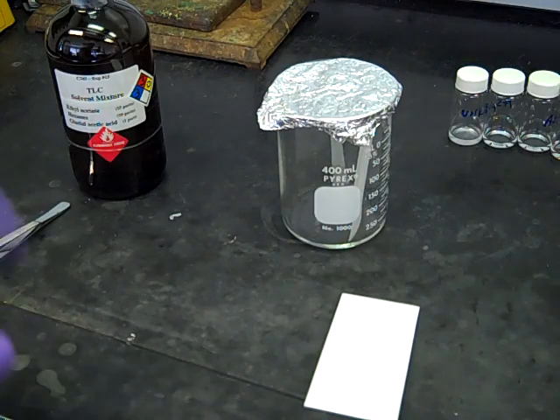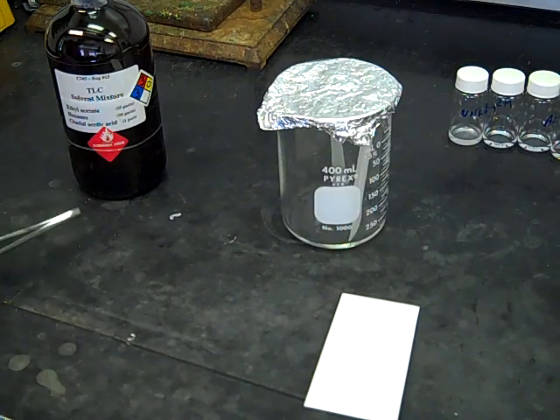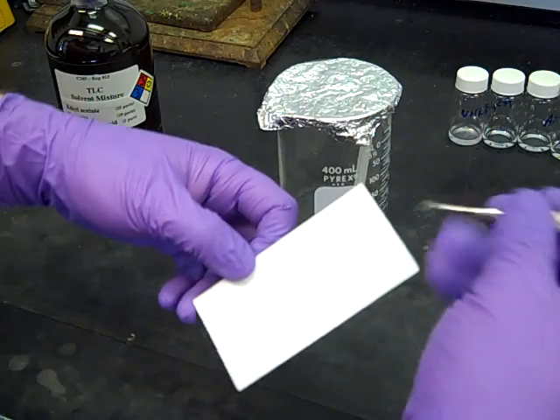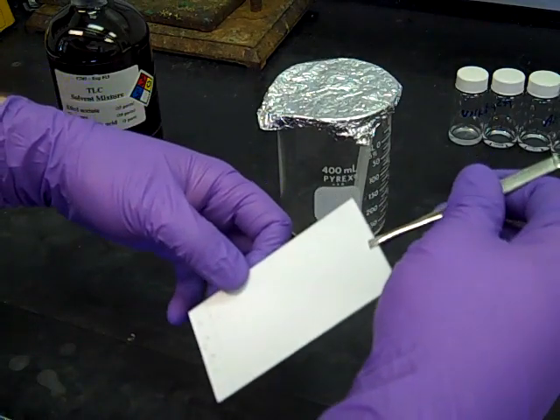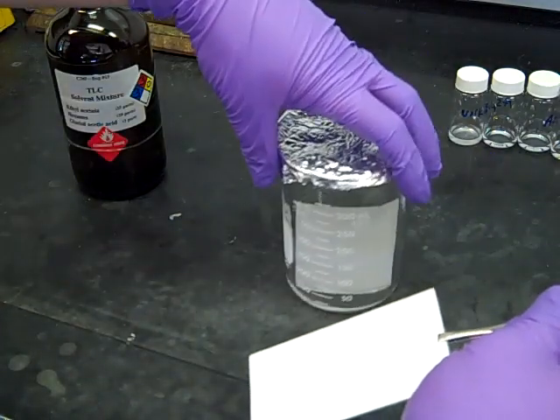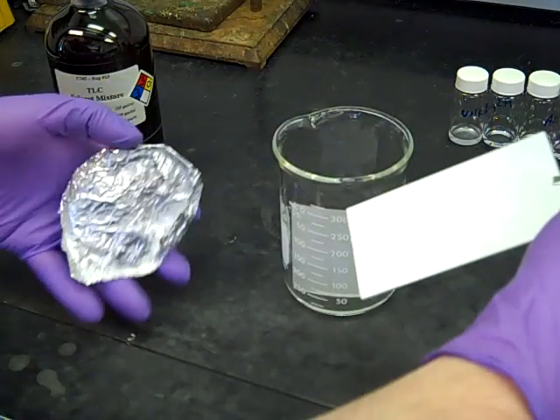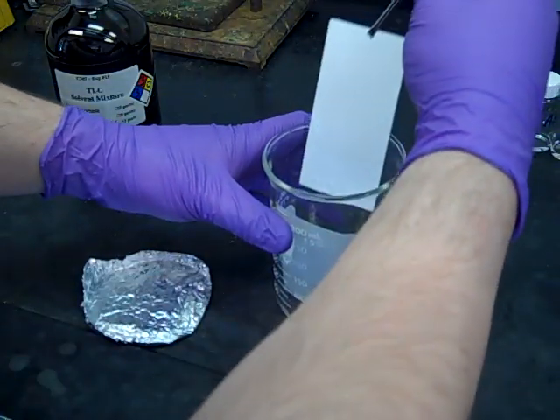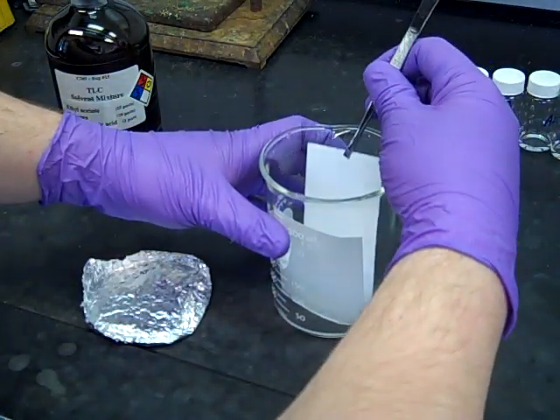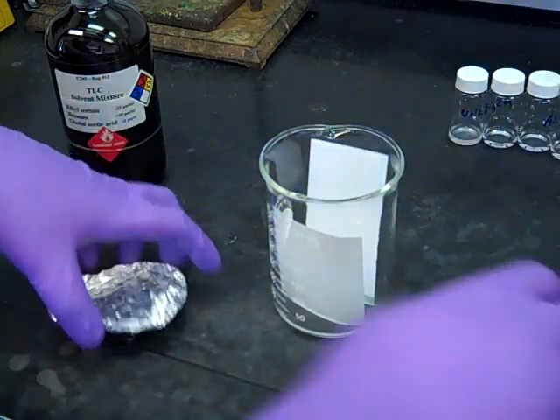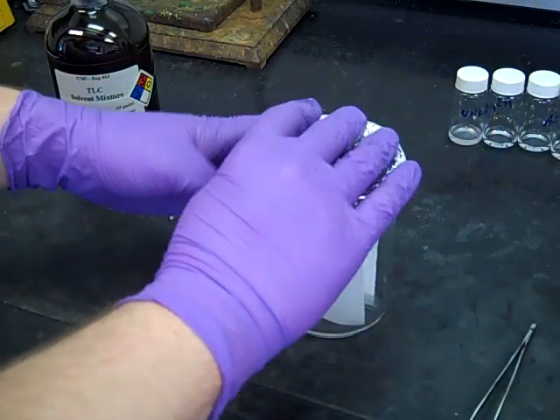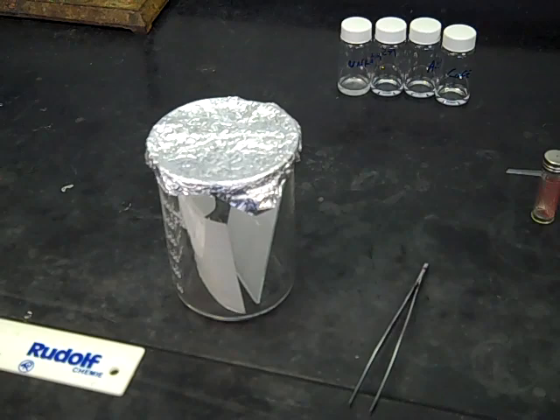Now that the vapors have filled up, we'll take our plate—you can use your tweezers at this point—open up the foil cap, make sure the plate doesn't touch that filter paper wick, and drop it down inside. Put the cap right back on top. At this point it's traveled an acceptable distance up the plate. I'm going to open the cap and pull the plate out.